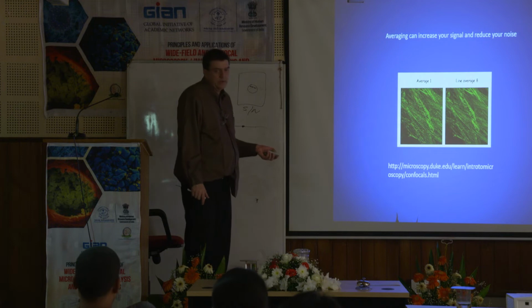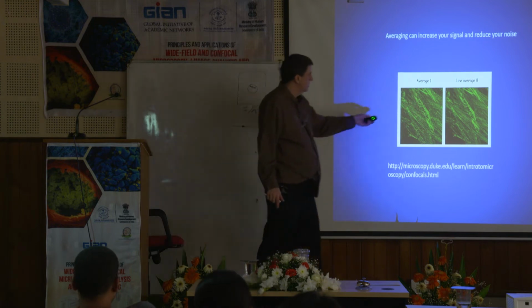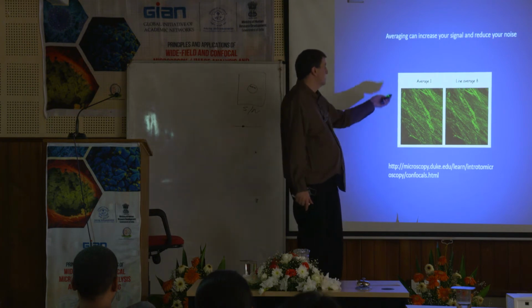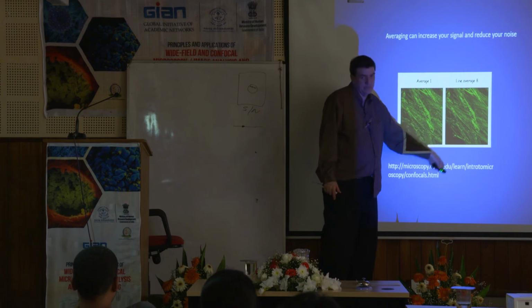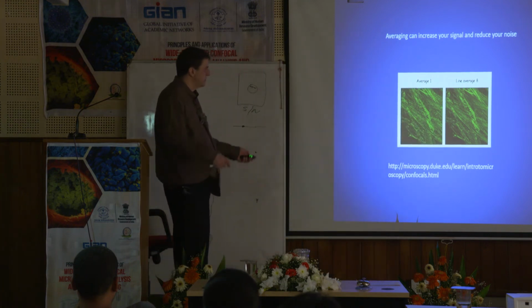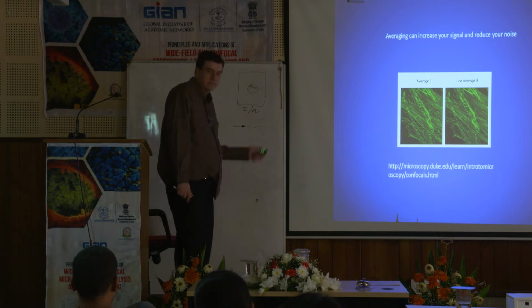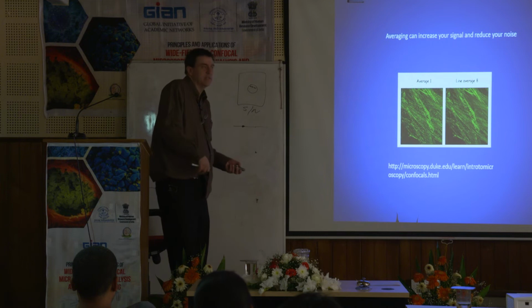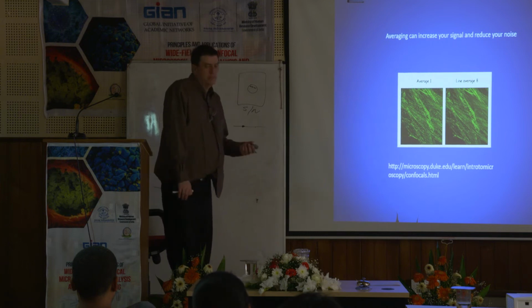And this is the kind of quality improvement you get. You ran it once, you got this. Well, you did a line average 8 times, so it ran 8 times across the line. It cleaned it up to this. Okay, it helps get rid of the noise. It just makes everything better. The signal pops out over the noise. Okay, so frame averaging is a thing to use to help improve the image quality.